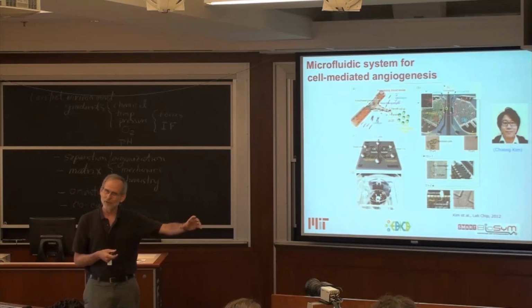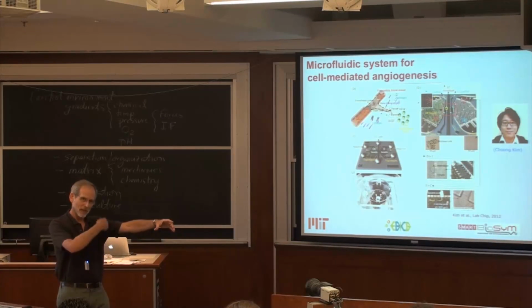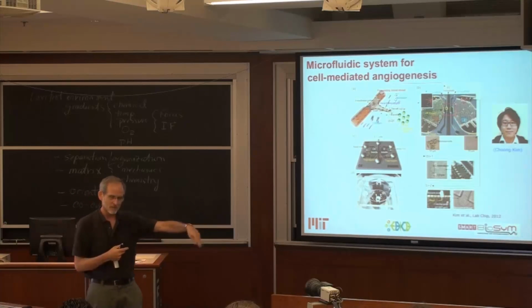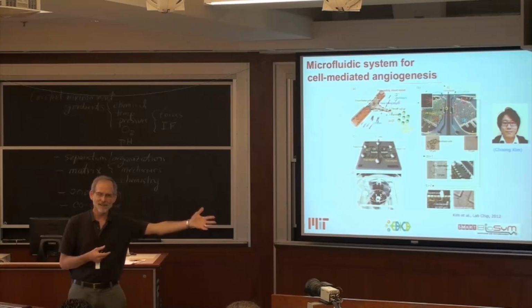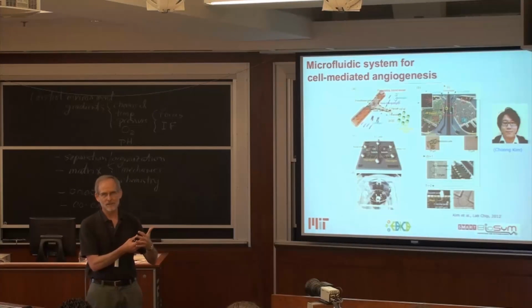In order to do this in co-culture and to do this stably, one of the problems you have is when you put another cell type in, say, the second channel, and say we have an endothelial monolayer in one channel, a gel region, and then a different cell type over here, these cells always tend to migrate into the gel, and they tend to intermingle with the vascular network.